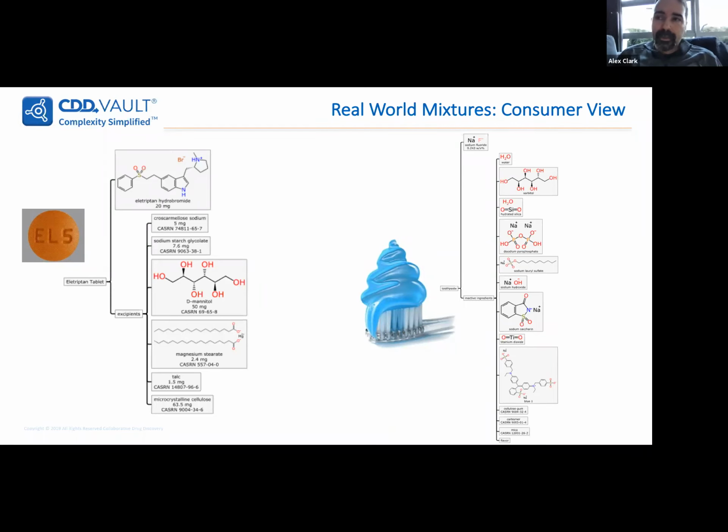Like, for example, gathering structure activity data and building predictive models. But one thing that might be quite significantly affected there is the ability to detect false positives. So if you have an impurity or a solvent, say, that's responsible for activity or lack thereof, having that mixture information could give you the key that you need to make that a lot better.